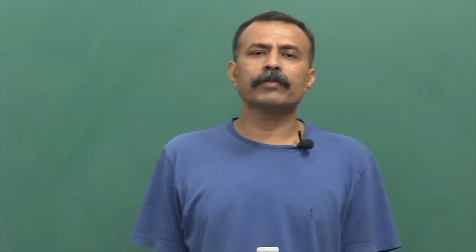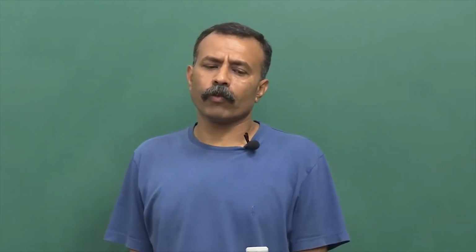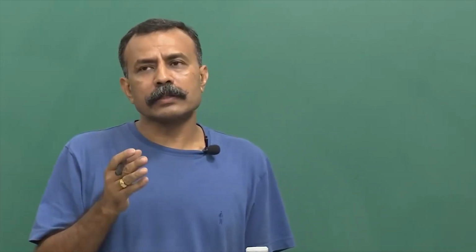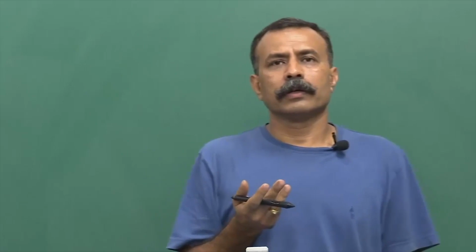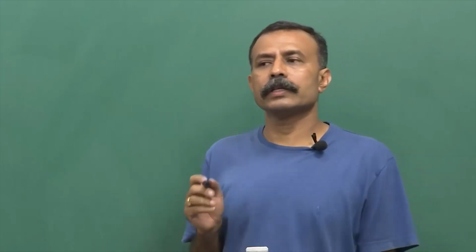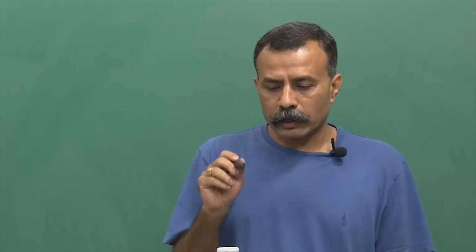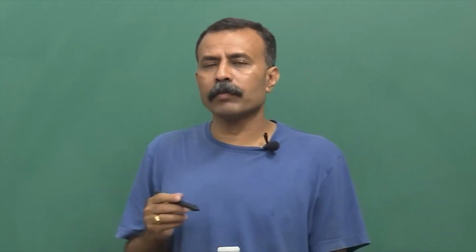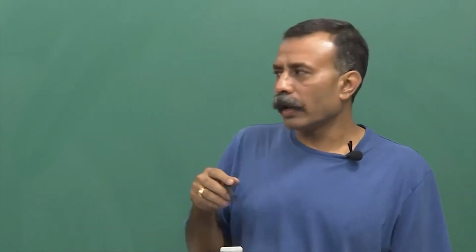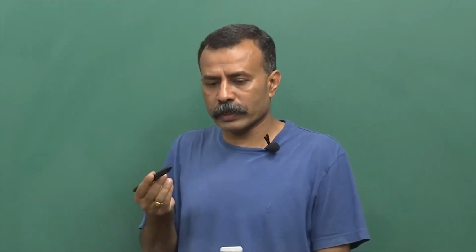So that's why it becomes very much more imperative that day zero, when you start to build up the facility, you think twice. Ask some of the colleagues who knows it. Discuss among the user group who will be using it. It is very, very, very essential. Think through it thoroughly. Okay. I'll close in here. In the next class, we will add up some new paradigm into this, what will make it a much better and much more beautiful facility.